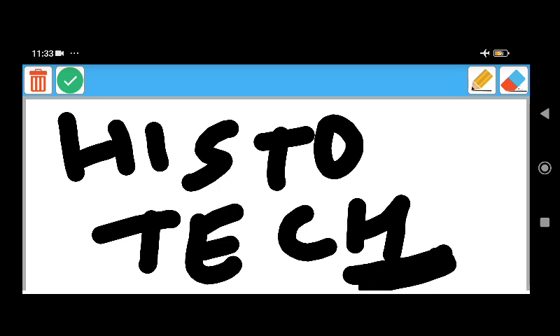Microtome knives for production of thin sections should be sharp and free cutting. If necessary, they could be disposable thin metal or non-disposable, resembling a razor blade. The cutting edge is formed by the convergence of two planes, the cutting facets or bevels. The cutting edge of the knife should be straight. The production of the fine straight edge depends on the hardness of the steel used and the angle of the bevels which meet to form the edge.